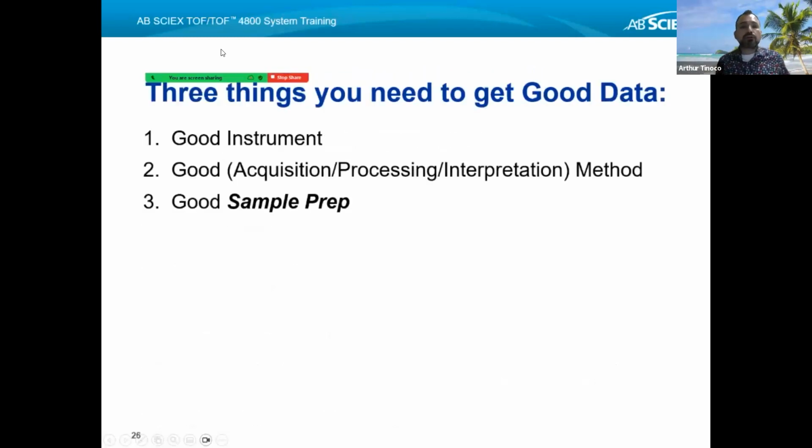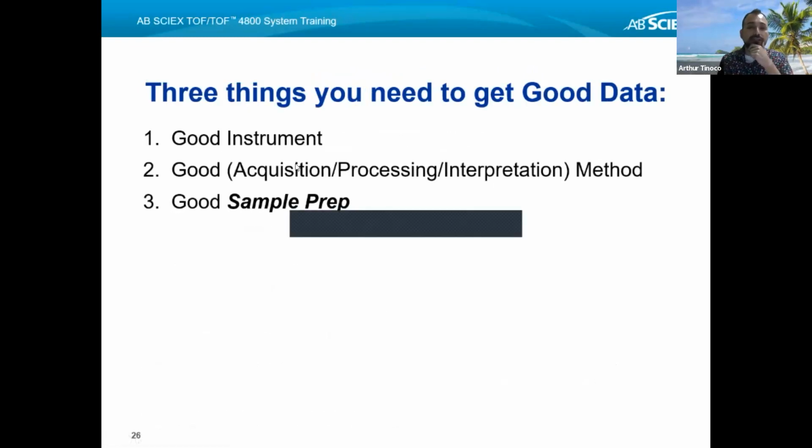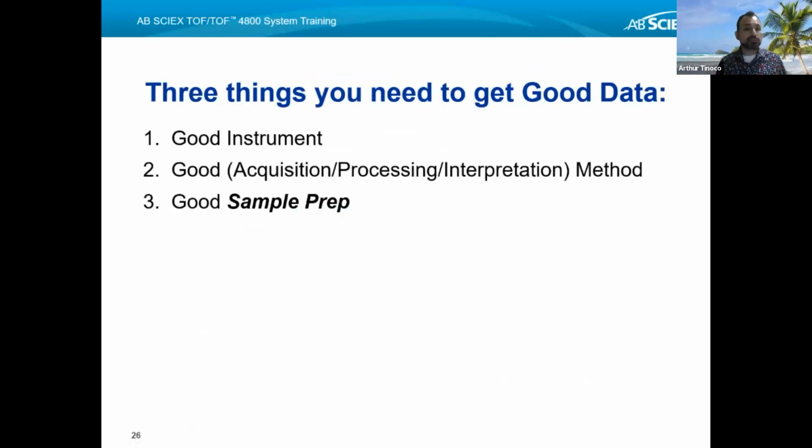All right, so in order for you to get good data, there are three really important things. The first is that the instrument is under good conditions. That's on me, the person who is facilitating this instrument, to make sure that it is in good shape. Prior to the start of the REU, there were a few technical glitches with the instrument. I made sure that they were resolved, and so the instrument is in good shape.